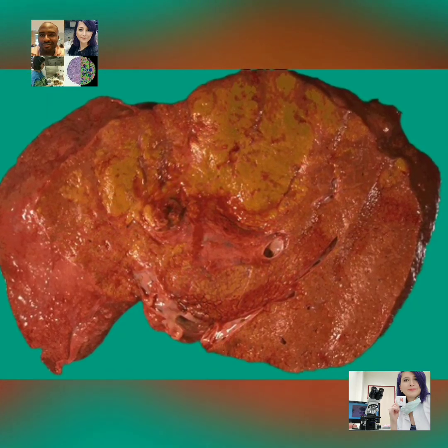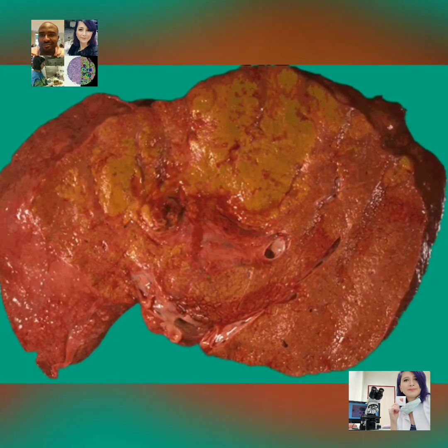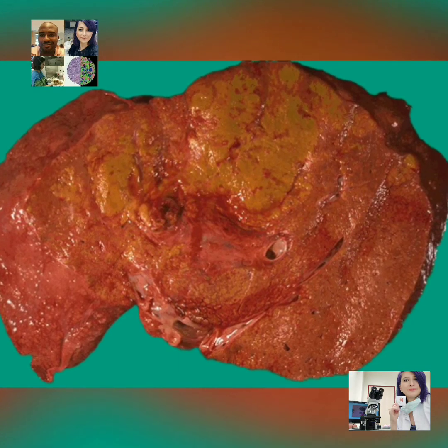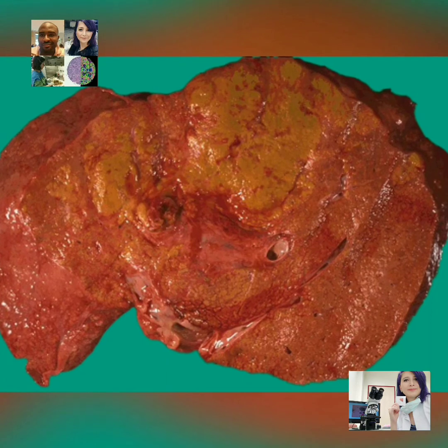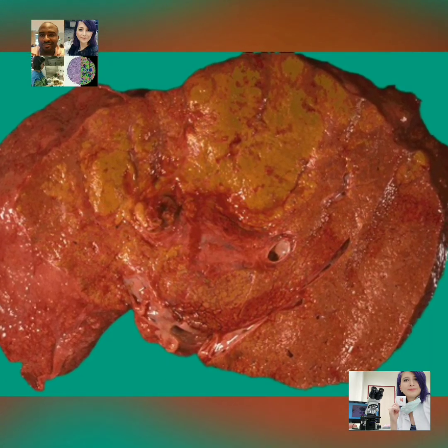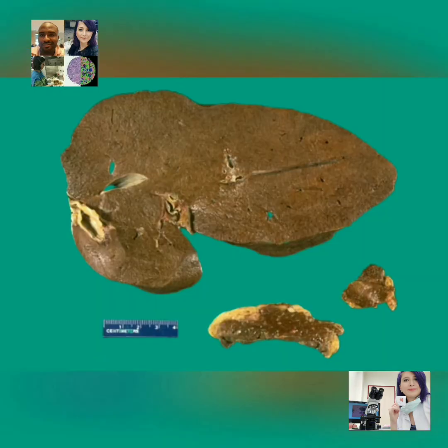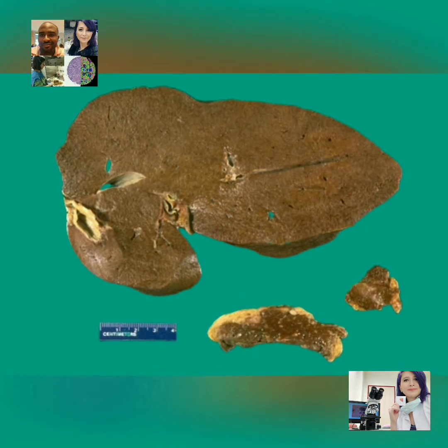Lastly, we come to the processing of the tissue samples. After the specimen has been dissected or after it has been appropriately biopsied, each of the biopsied segments are separated and separately kept within tissue cassettes. Each cassette is appropriately labeled and indicates where the sample or the biopsy was taken from.